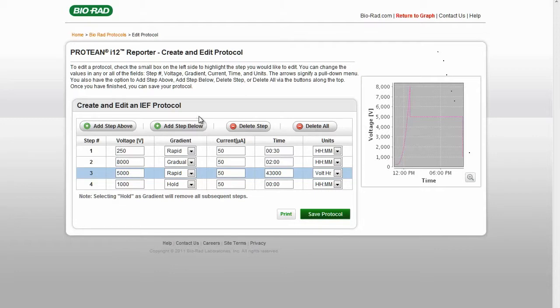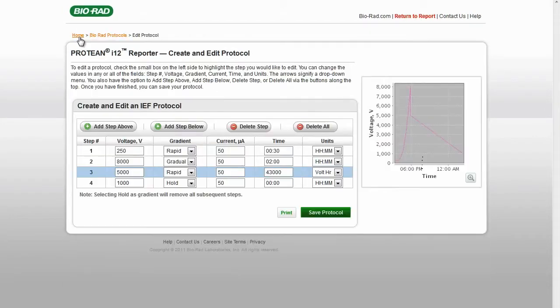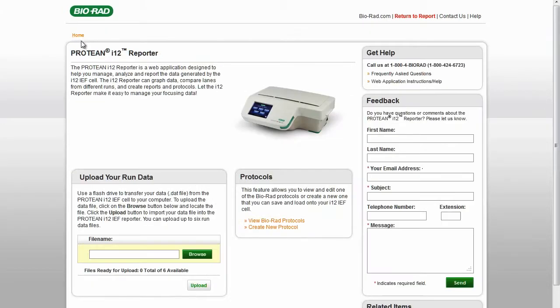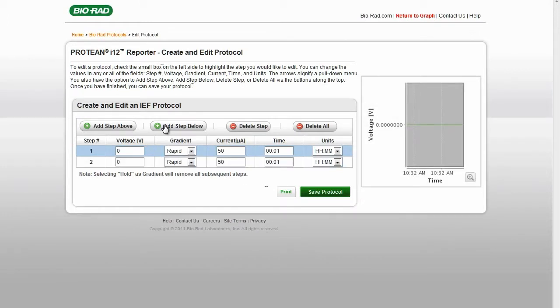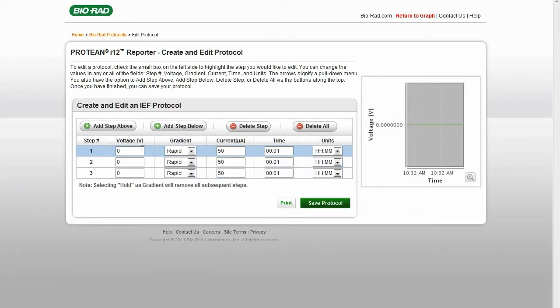If you would like to create a new protocol, return to the Home screen. New values can be added for Voltage, Gradient, Current, and Time. Steps can be added above or below, or deleted.